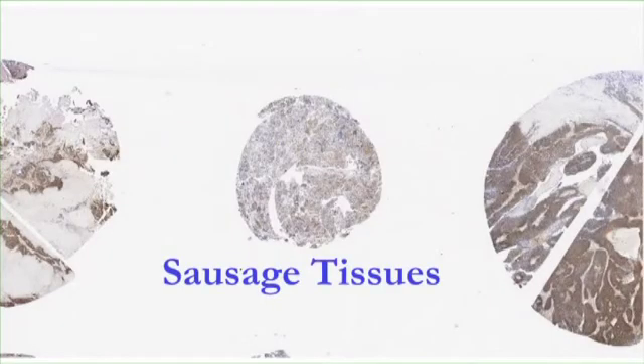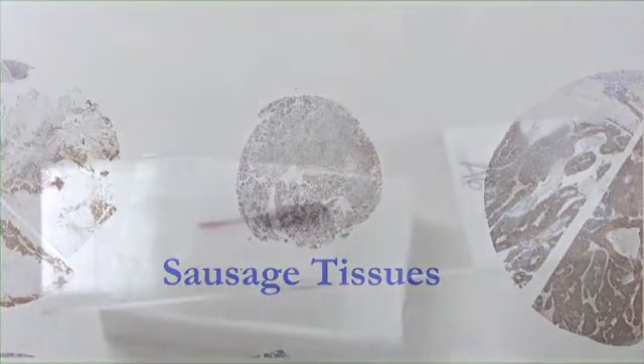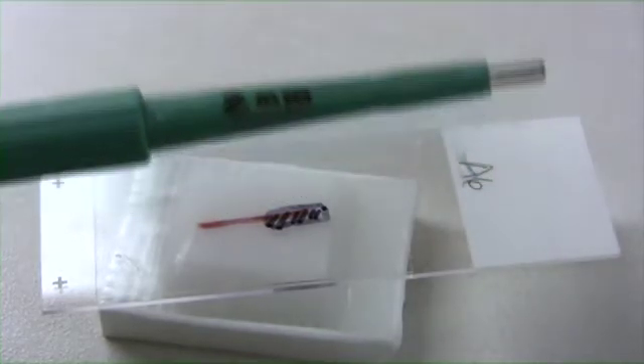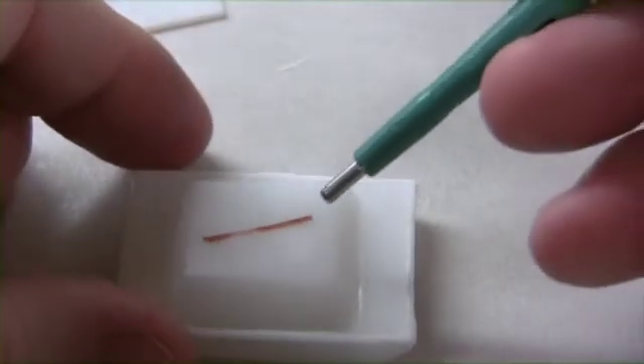As I mentioned before, I am constructing a 3.5 millimeter TMA. Some of the tissues selected for this TMA are either scant, biopsies, or needle cores. So the 3.5 millimeter needle is not an option here. We are going to construct a sausage using the 2 millimeter needle.